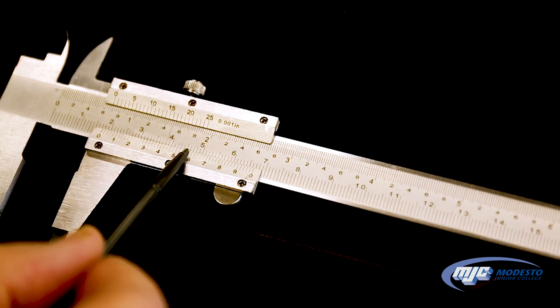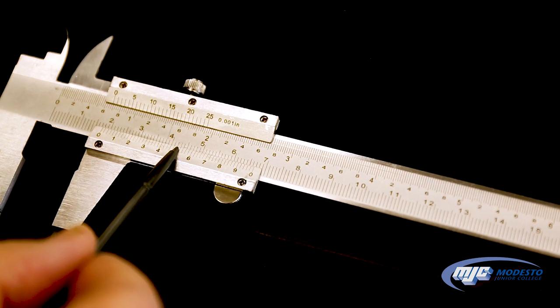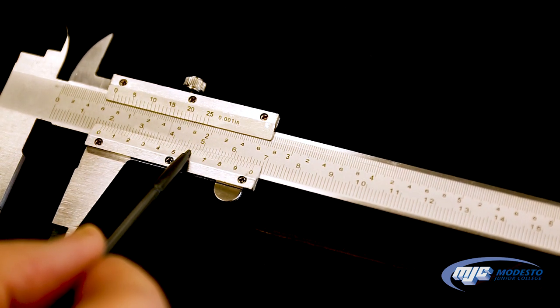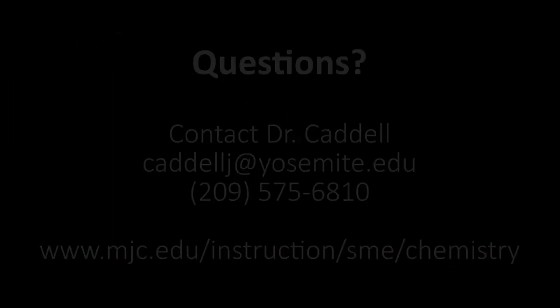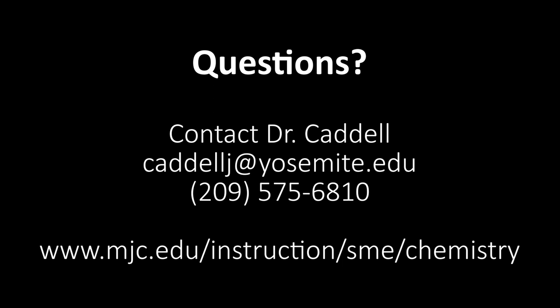So this measurement would be 1.756 centimeters. And that's all there is to it. Thank you.